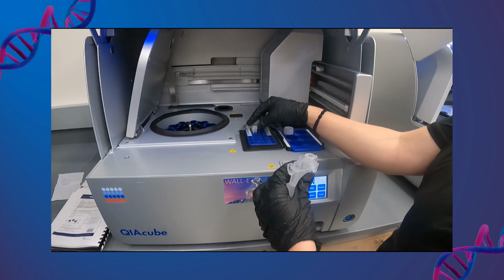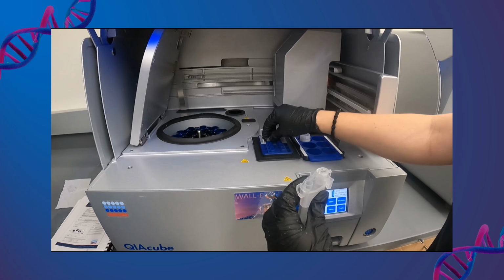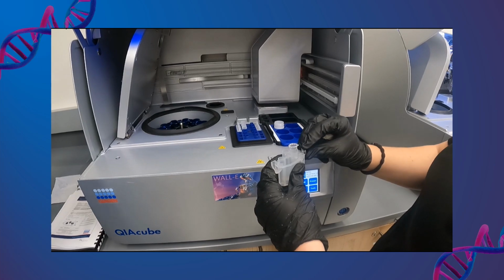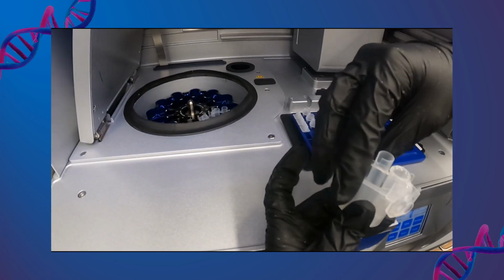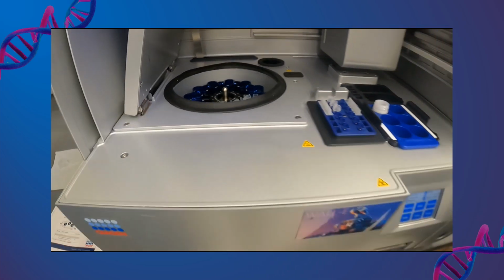Here we can see the inside of the cube. On the right, there are places to load reagents, pipette tips, and microcentrifuge tubes for sample collection. In the back left, you can see the centrifuge that is necessary to complete the differential extraction. The sample is loaded into a rotor adapter which has slots for tubes for the initial sample and allows waste to go into the bottom. After the lysis in the cube, the samples are purified in the easy 1.